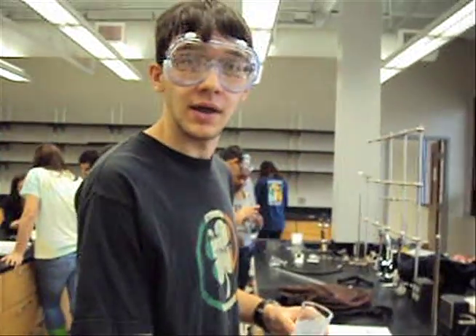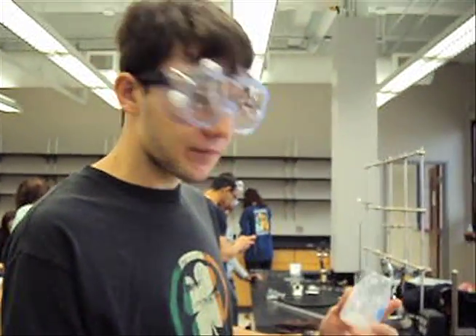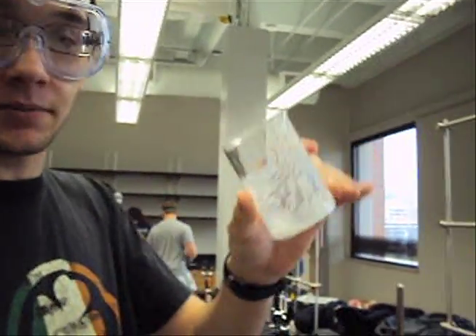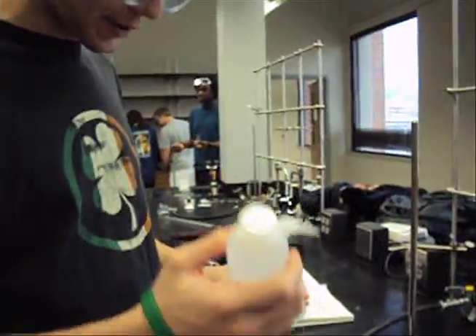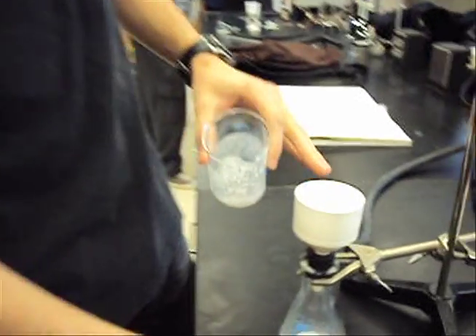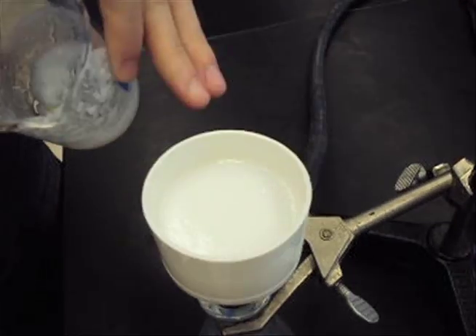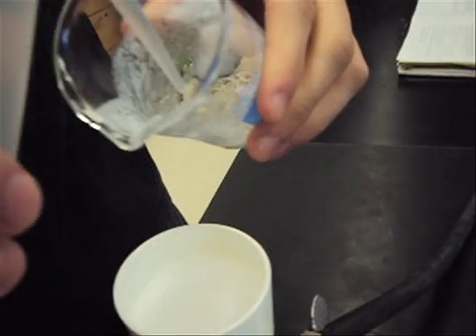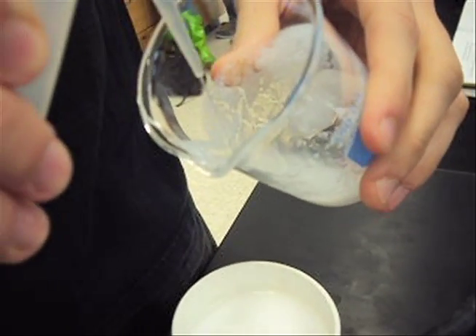Hi, I'm Claire. For the next step, you can see that there's still precipitate left in the beaker, so what you need to do is take some DI water. You might want to wait for the level to go down a little bit so it doesn't overflow, but once it gets to a certain point, you can just rinse this off as we're doing it.